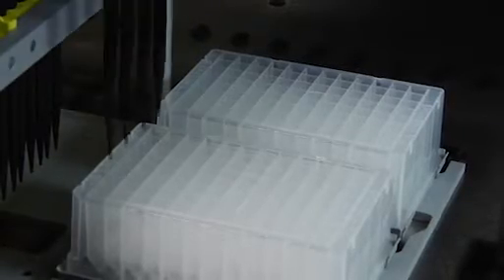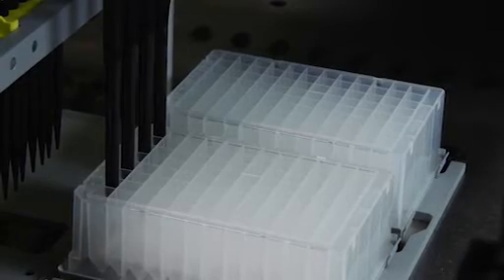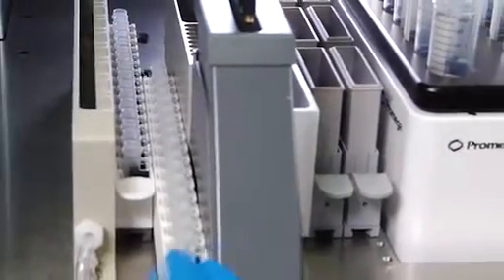Samples may be placed in standard SBS format plates or eluted into 2-milliliter tubes that are loaded onto the robot prior to elution.